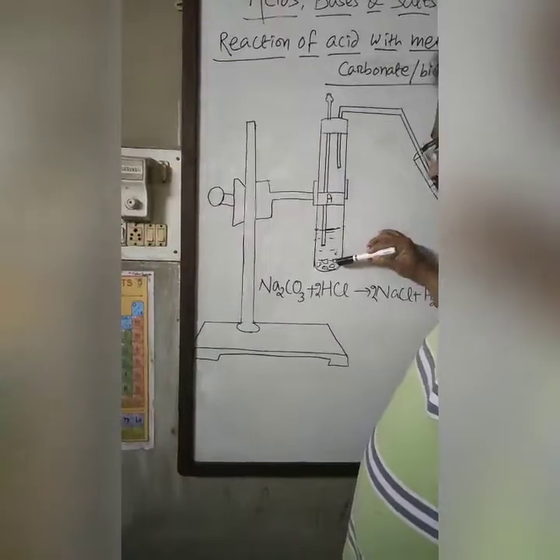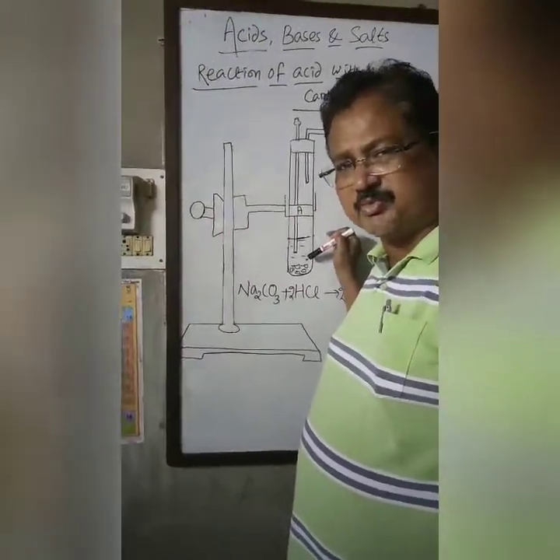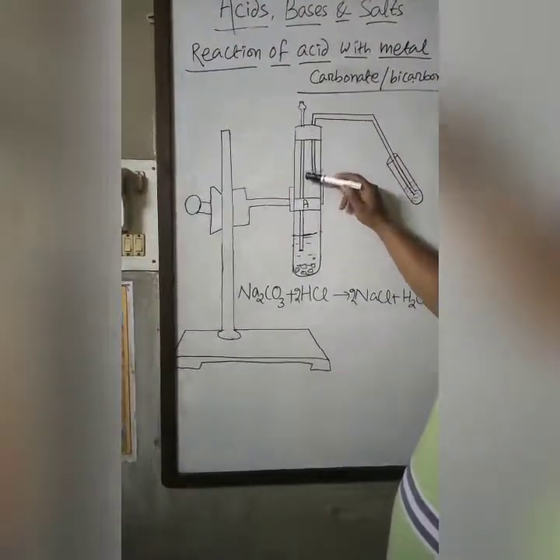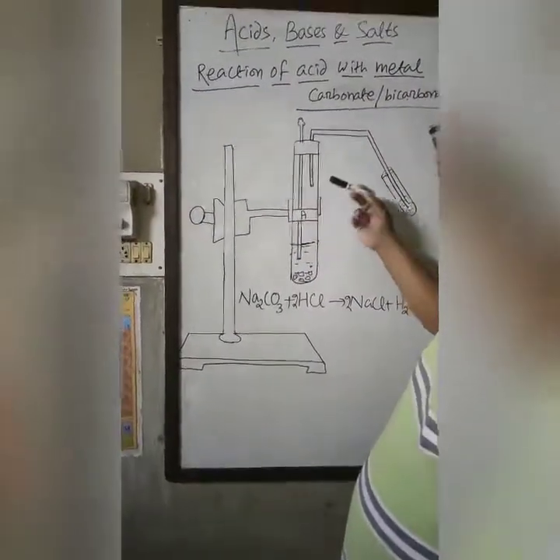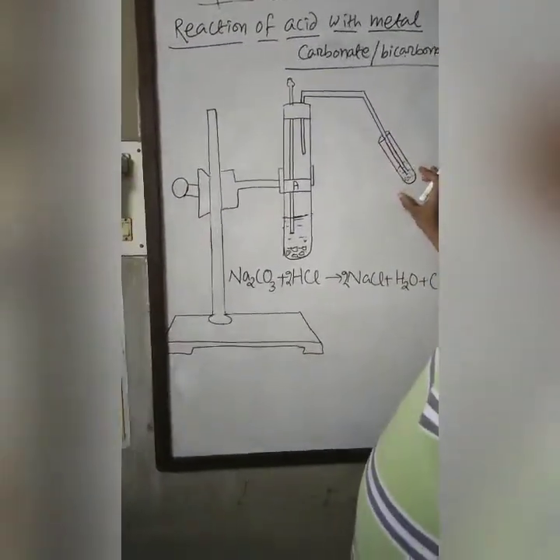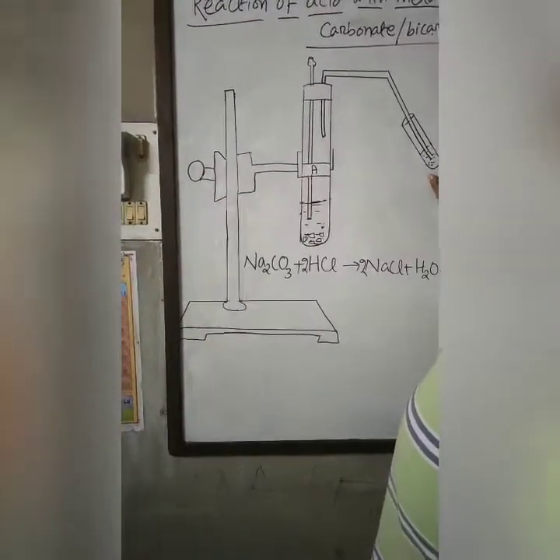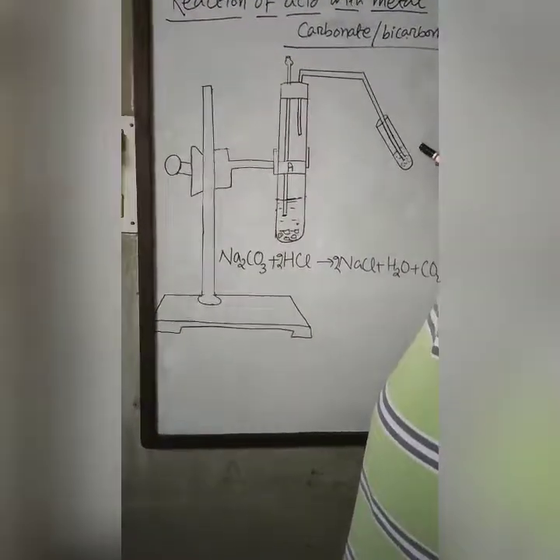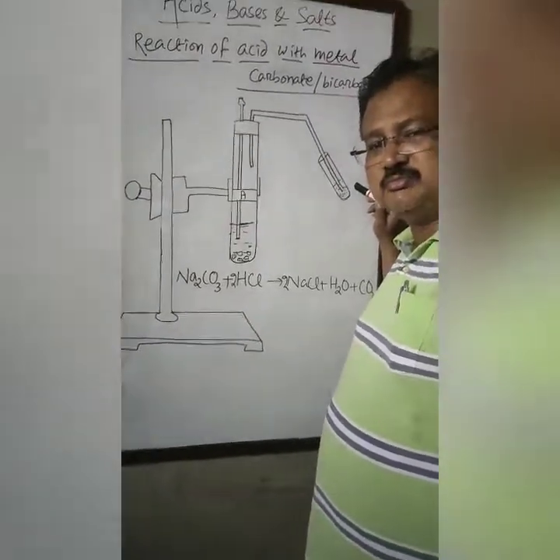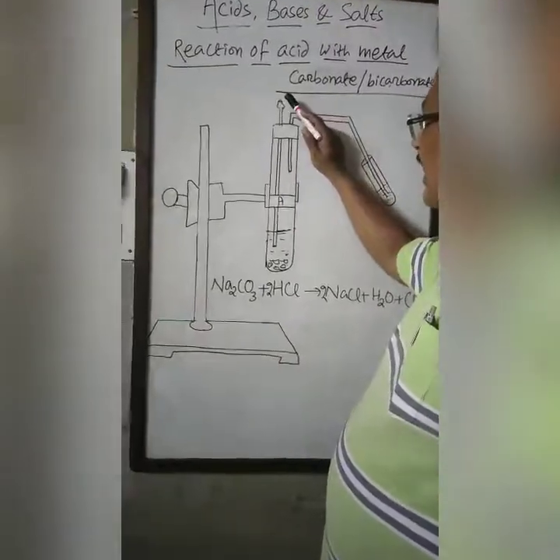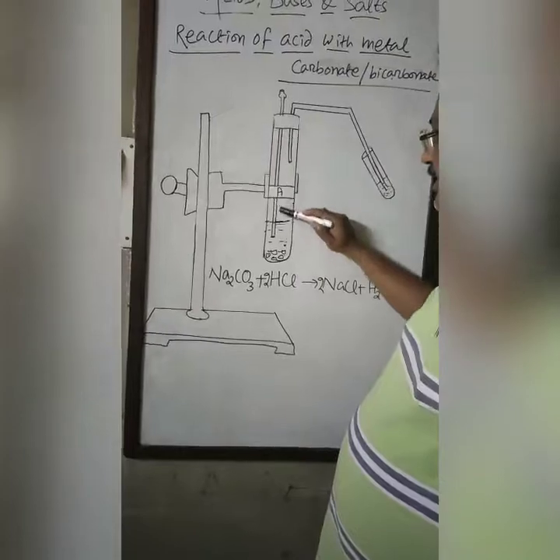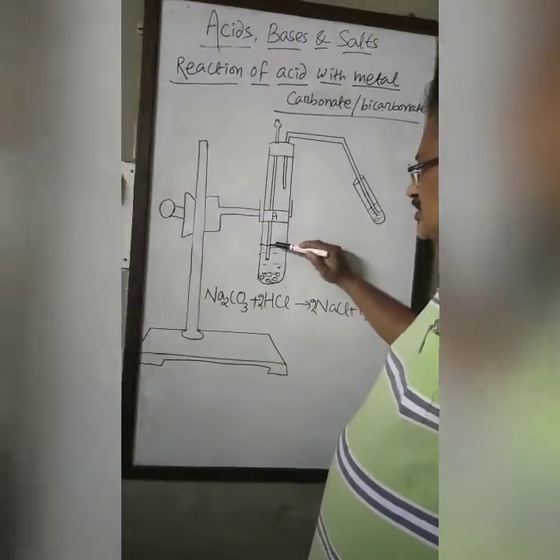Here we have taken some sodium carbonate — sodium bicarbonate can also be taken — and slowly some dilute acid is added to it. This tube has been connected to a test tube containing some fresh lime water. Lime water is a clear solution of calcium hydroxide. The thistle funnel is immersed inside the solution.